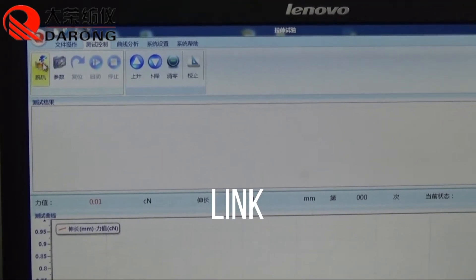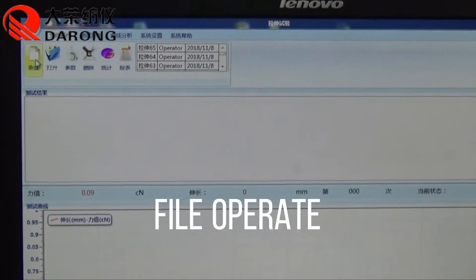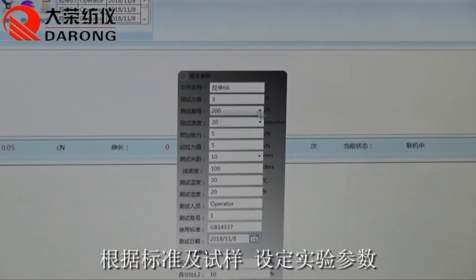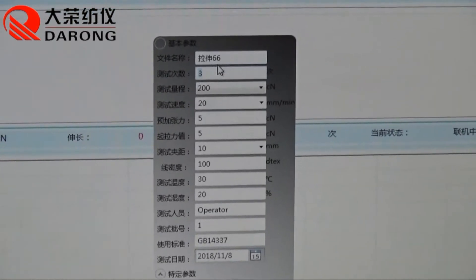Link the instrument. Open the file. Set the experimental parameters according to the standard and sample.